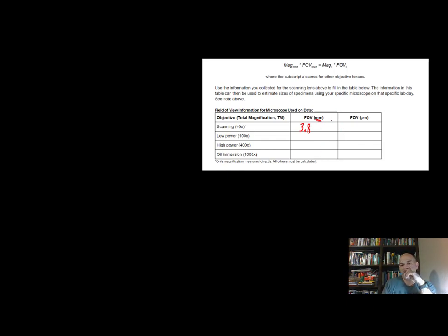Okay, so it turns out there's a relationship. Milli is 1,000 times smaller than a meter, and then micro is 1,000 times smaller than that. So milli means 1,000th of a meter, and a micro is 1,000 times smaller than that. So that actually makes a micro 1,000,000 times smaller than a meter. But the micro compared to a millimeter is 1,000 times smaller. And so that means a simple conversion to go from milli to micro, which is a much smaller unit, is to just multiply by 1,000 because micro is 1,000 times smaller. So 3.8 millimeters is exactly 3,800 micrometers.